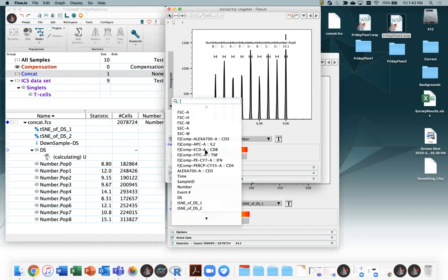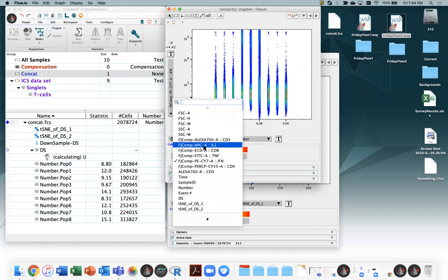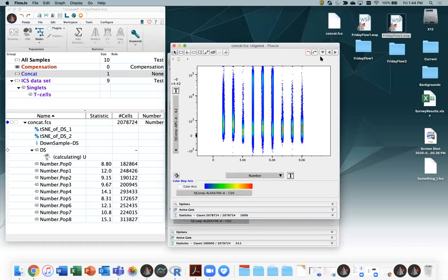So if we would look at something like interferon gamma, we'll expect to see some difference in the expression levels, particularly the middle 3 there. The PMA stimulation is way more powerful. That's kind of what we're going to expect. IL-2, again, a lot more in the PMA, the 3 PMA samples in the middle. So we'll expect to see some difference in the populations that emerge out of the various tools.